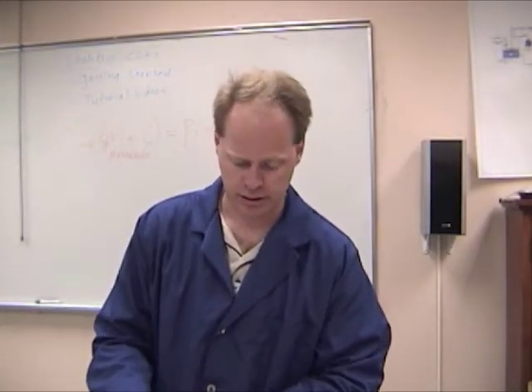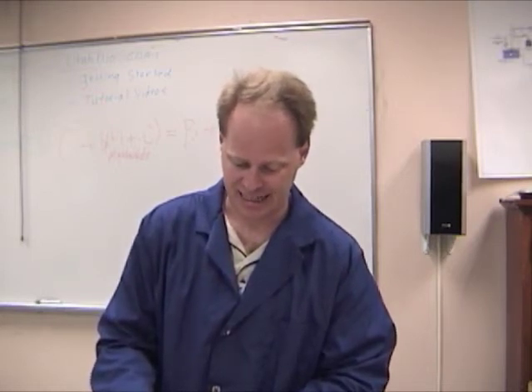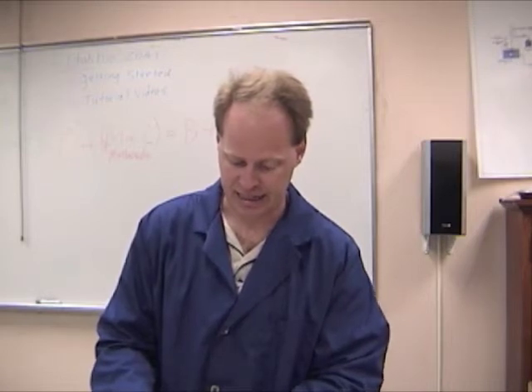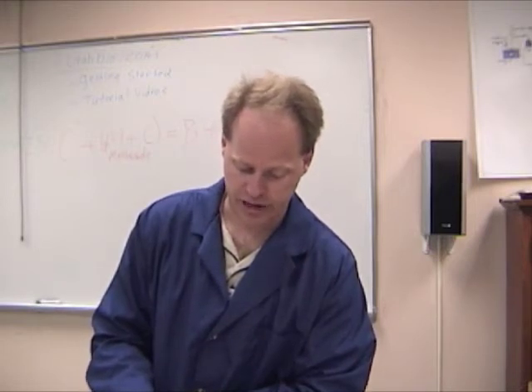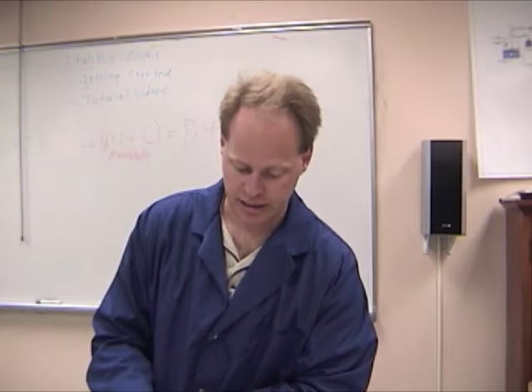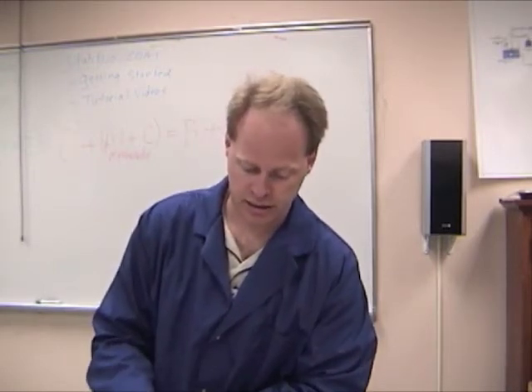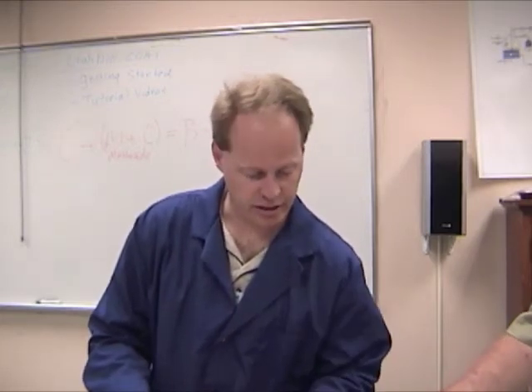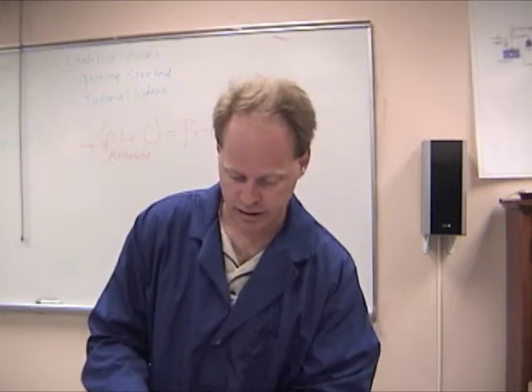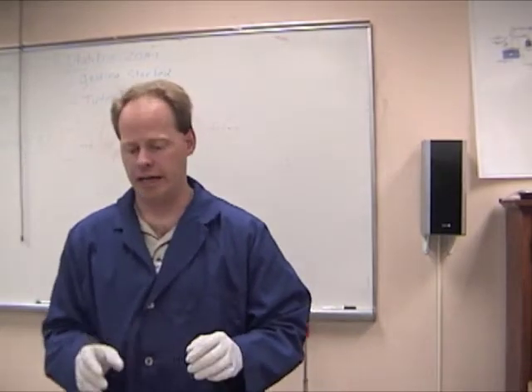Not very much. One gram of KOH is just a few flakes. Point 0.5, 0.6, 8, 9, I don't want that big flake in there, 9.5, right. 1. Okay, and again, you want to be as accurate as you can.